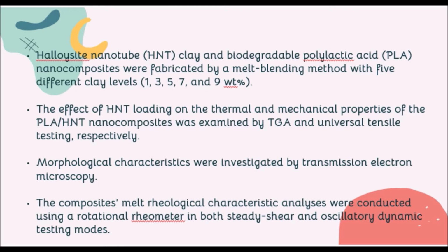And the third one is the morphological characteristics, which were investigated by using the transmission electron microscopy, which is known as the TEM. And then for the composite, the rheological characteristic analysis was conducted by using a rotational rheometer in both steady shear and oscillatory dynamic testing mode.